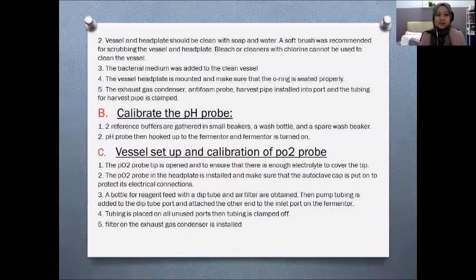Next, after the vessel is set up, the vessel and head plate should be cleaned with soap and water. A soft brush was recommended, and bleach or cleaner with chlorine cannot be used to clean the vessel.